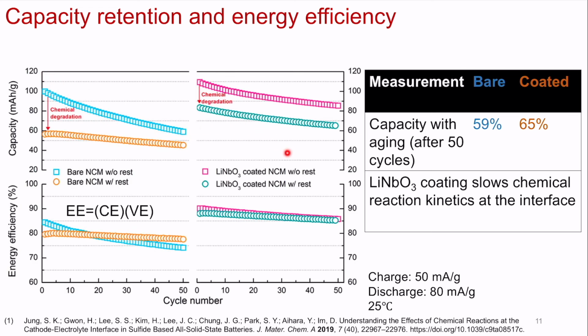But the capacity retention is slightly higher at 65% versus 59% for the bare sample. Energy efficiency is similar. You can retain higher energy efficiency for coated versus uncoated.